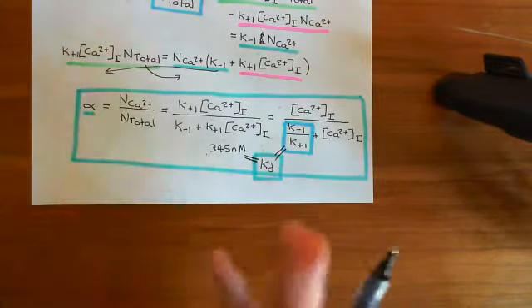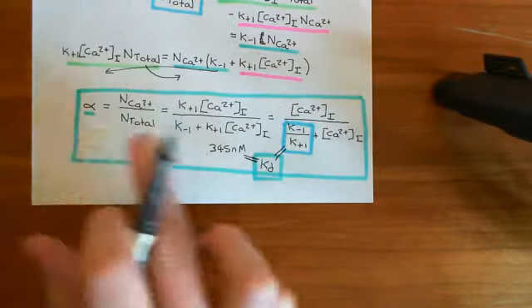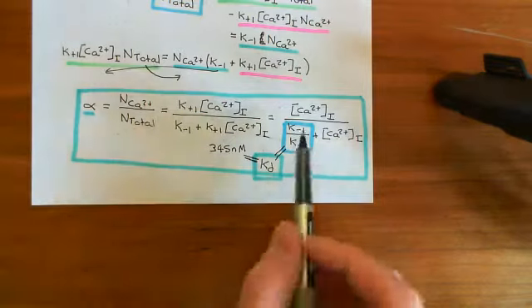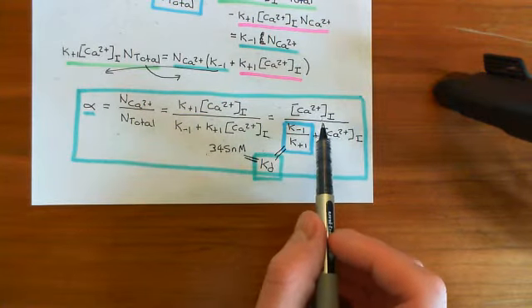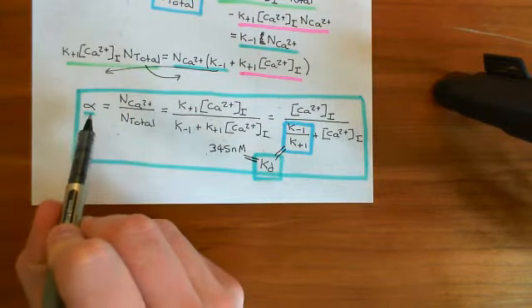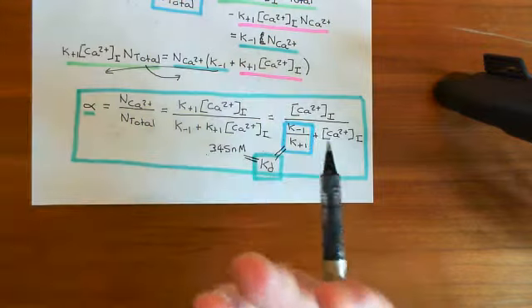If you've loaded in 1,000,000, this formula will work. This gives you the fraction of whatever total number you've added in that will have calcium bound under this intracellular calcium concentration. The assumption is that the number that you have loaded in is nowhere close to the actual number of calcium ions within the cell.